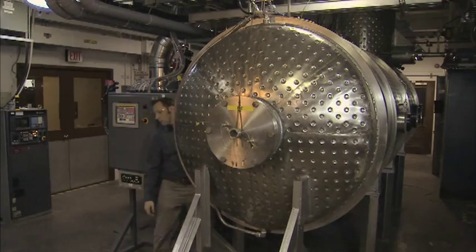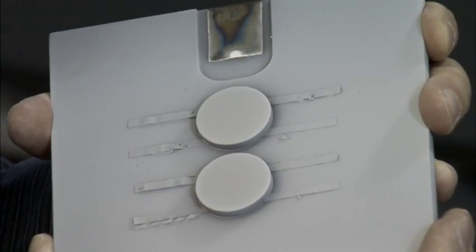The vaporized material condenses onto the target substrates and the coating is created. After the run, the chamber is brought back up to pressure and the samples are removed for testing.